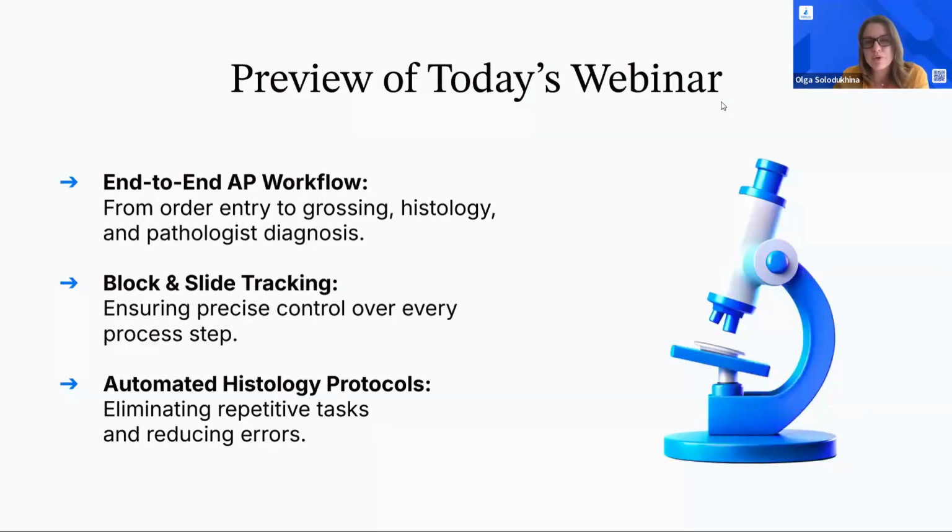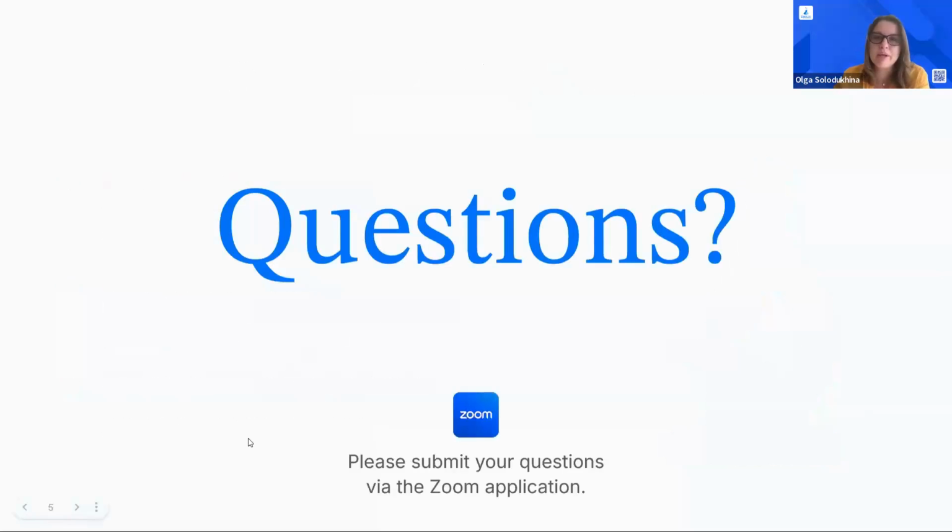So it depends on how you would love to approach your business, whether you're looking to scale and grow and become the bigger lab that needs a really profound, well-structured solution. We wouldn't be the cheapest on the market. So that's always the question, like that will definitely pop up.